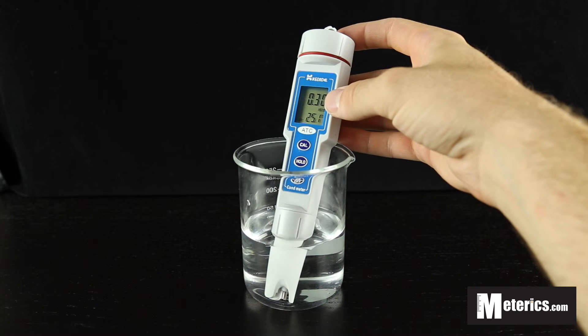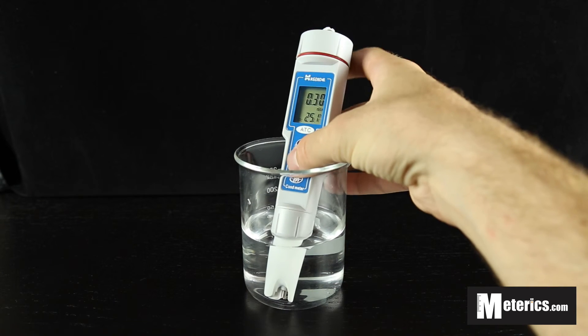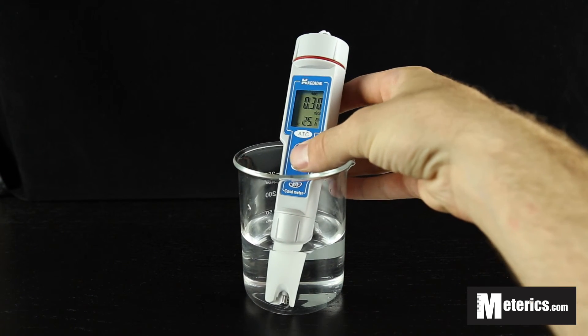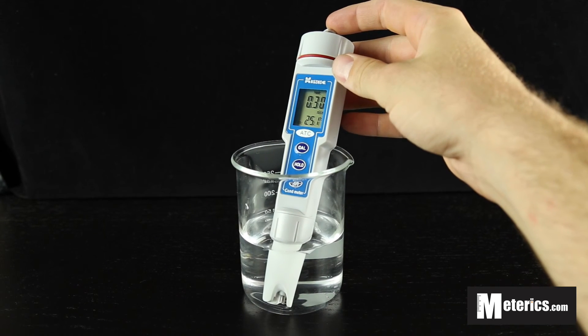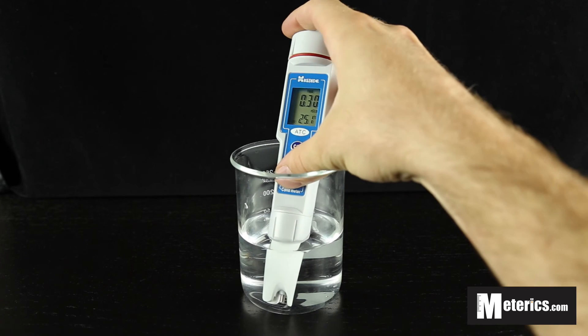So as you can see, once your reading has leveled out, you can hit the hold button just to stabilize it and you're ready to write down your recordings. And that's about it for today — thank you guys very much.